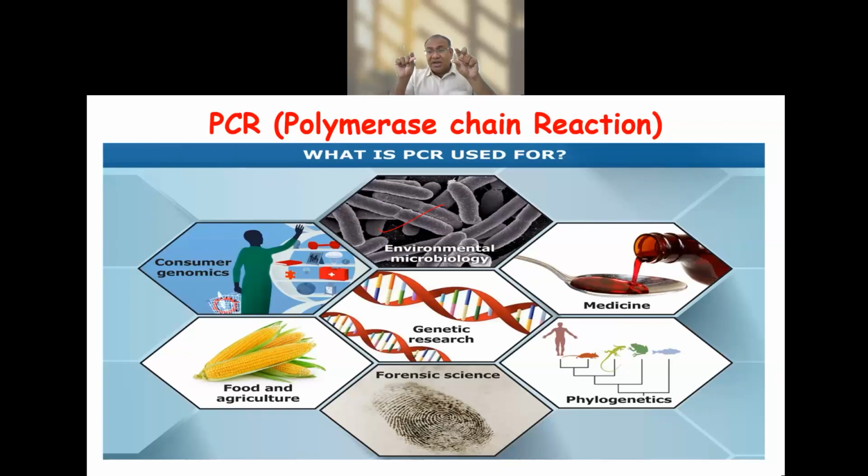They have used it, made this. So I need this polymerase chain reaction to be developed because I should know the genetic sequence of that particular antigen, that particular substance or bacteria or the virus, which I am making artificially, using artificial intelligence. So I can say that the PCR technique, which we call polymerase chain reaction, is a technique of artificial intelligence. When I made this statement, I support my statement with the scientific evidence later.